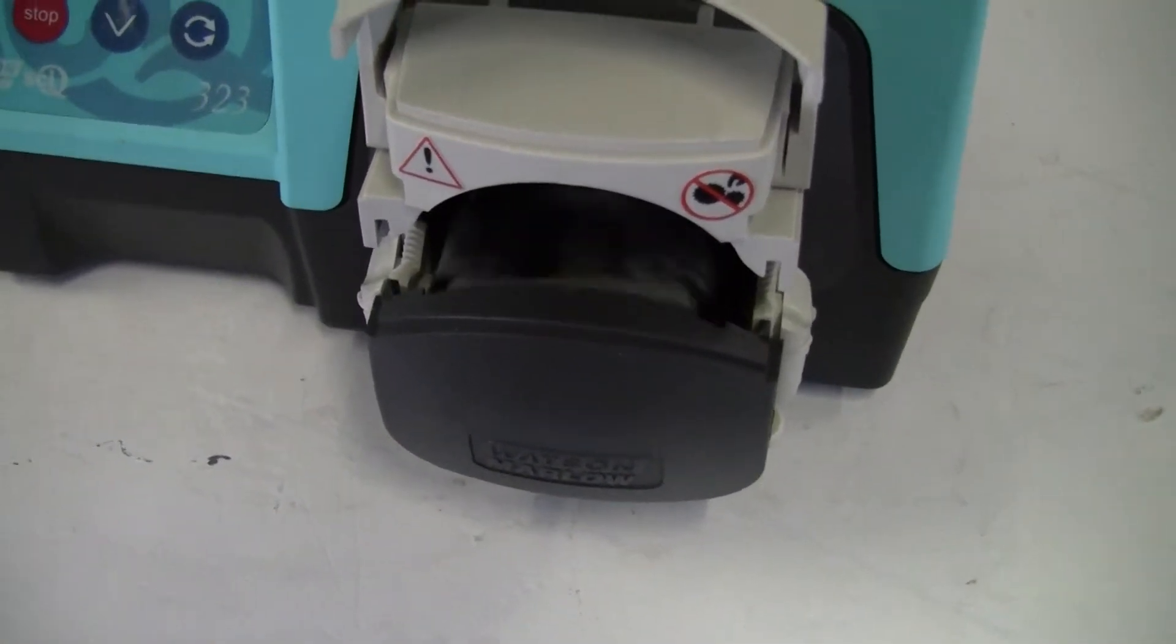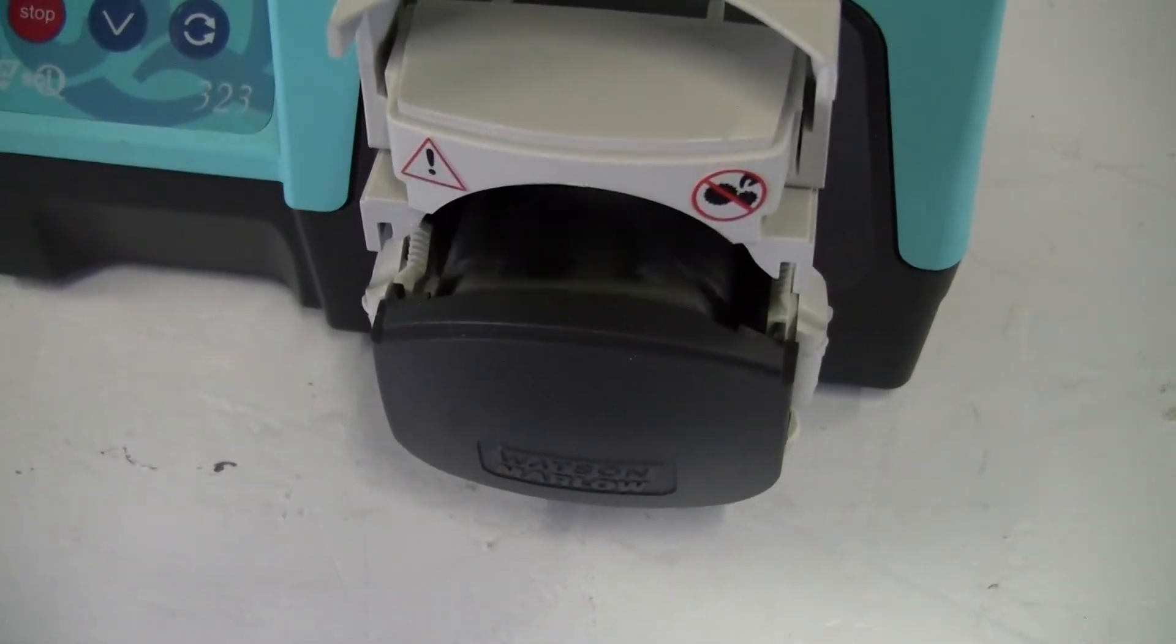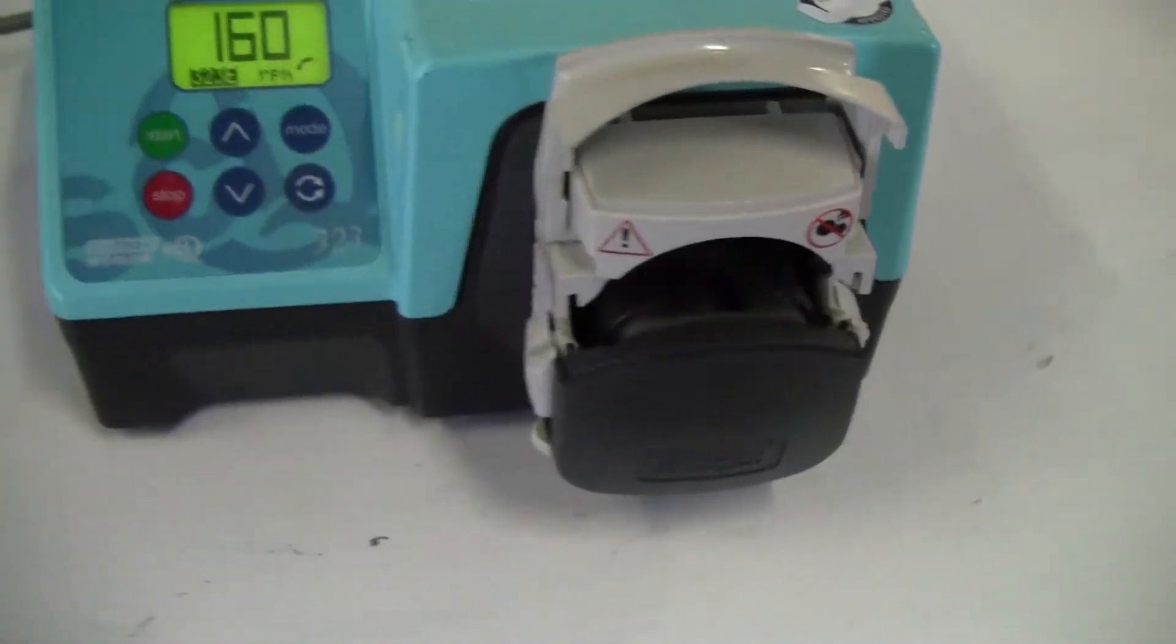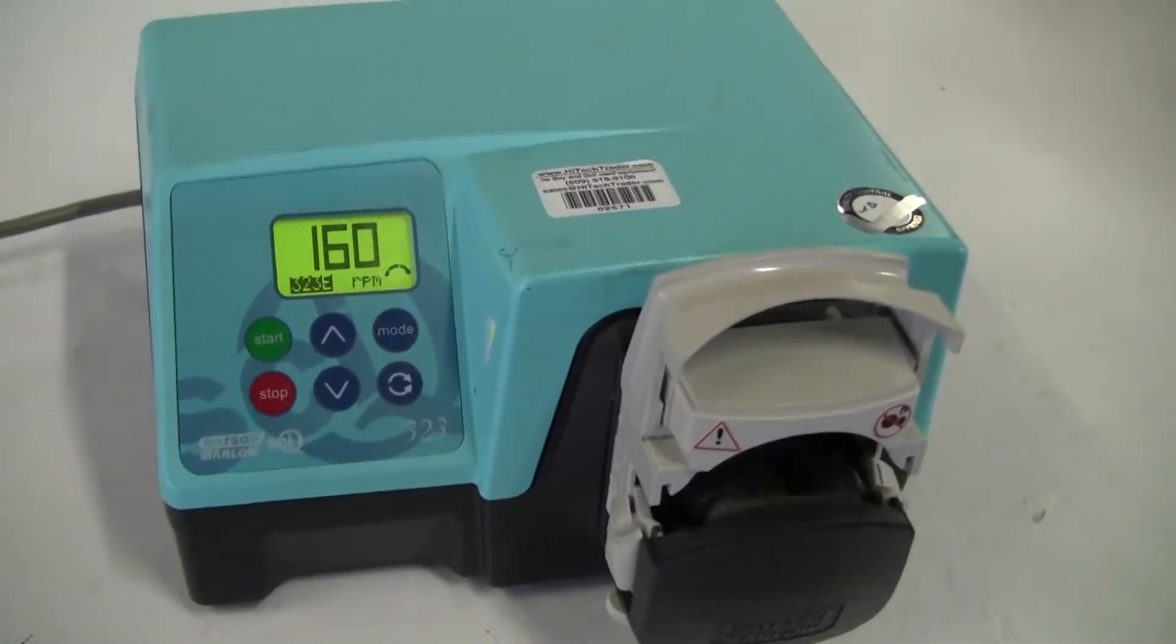It's got seven different tube sizes from 0.8 millimeter to 8 millimeter. It's currently hooked up to 120 volts.